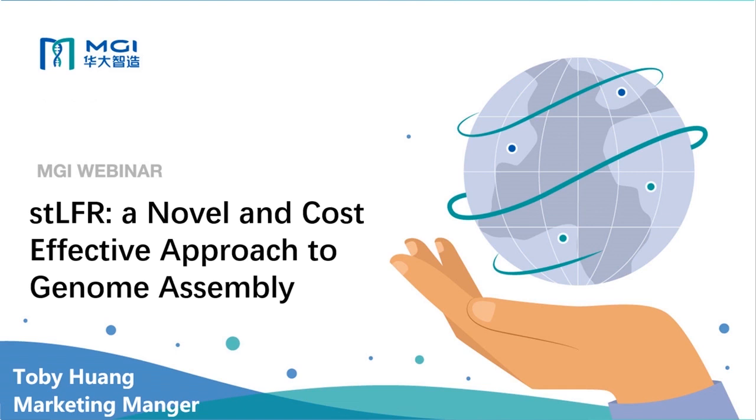So today our topic will be on stLFR, single tube long fragment reads, a novel and cost-effective approach for genome assembly. And we'll also talk about some of the other applications that we can use for this long read technology.